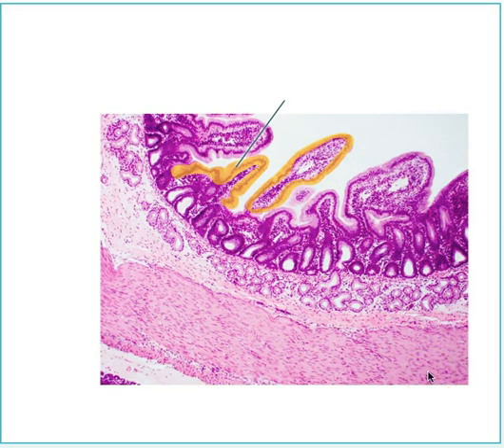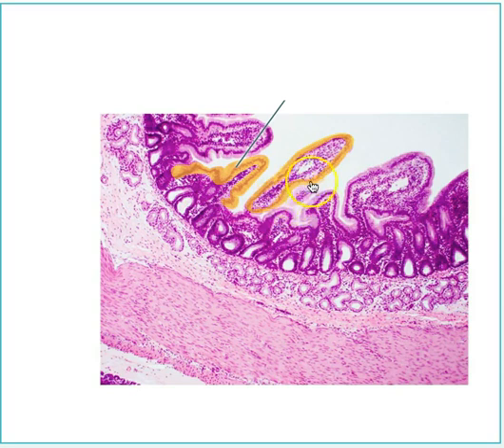Now we have a lower magnification. What is the tissue at the highlighted area? I see tall cells in this tissue. I see elongated nuclei, tall cells, one layer. This has to be simple columnar epithelium.